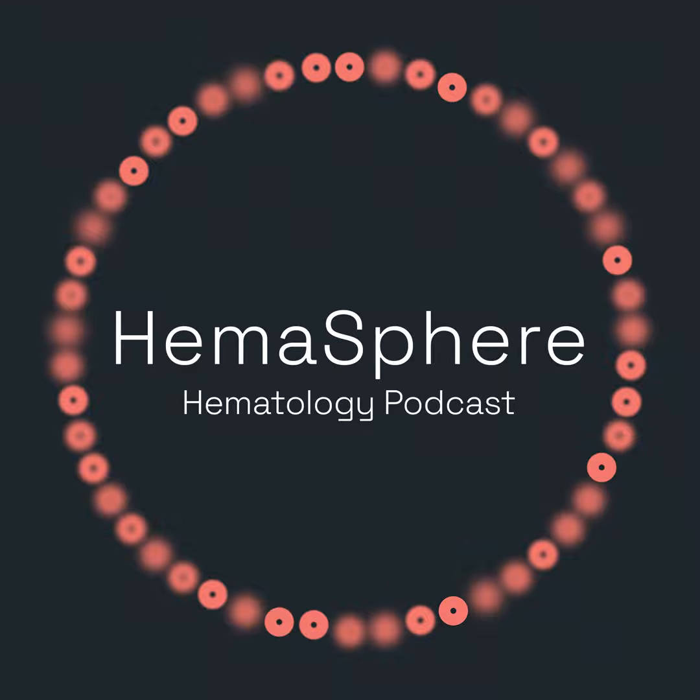But flow cytometry is, of course, also evolving at the same time with these spectral panels. And I think the implementation is really accelerating at this point for flow as well, because we are validating these different panels that can be evaluated in a standardized way. We don't have to argue that much about which markers are in the panels, which was a very big debate for many years. And with spectral, we don't have to worry about that much anymore, because everybody can have their own little marker in the panel. Favorite marker. Yes, true. So I think that looks promising.